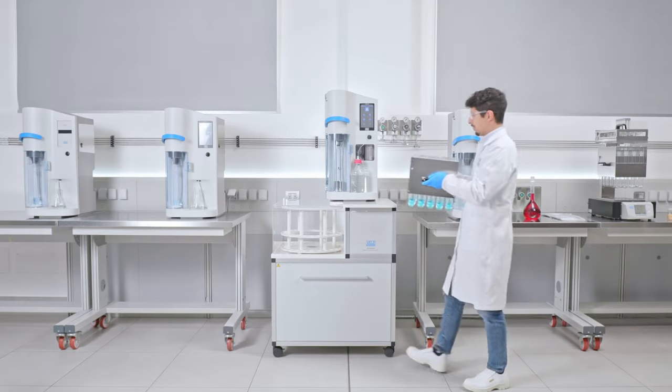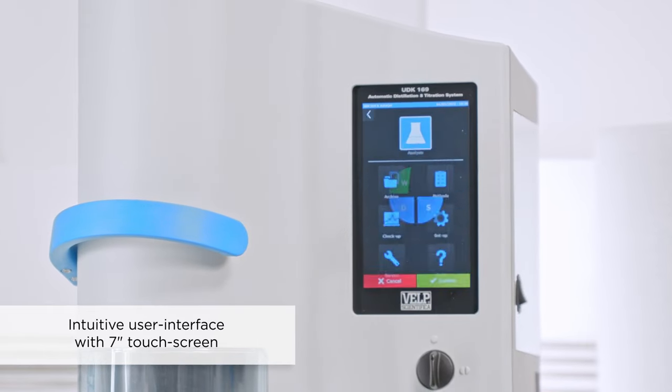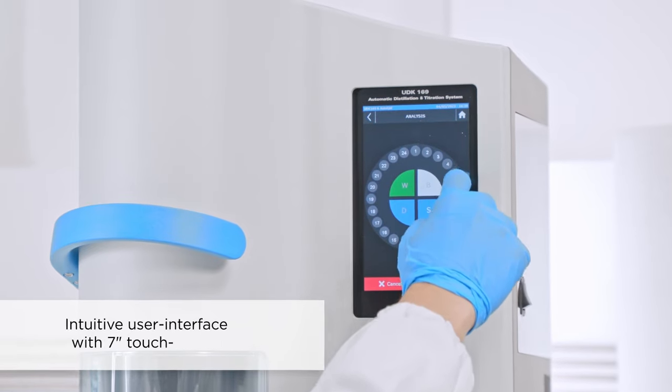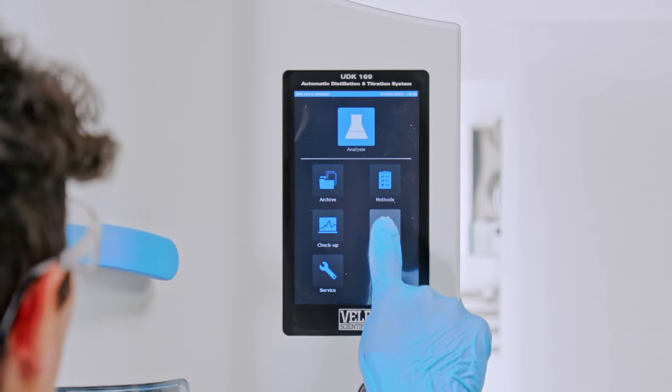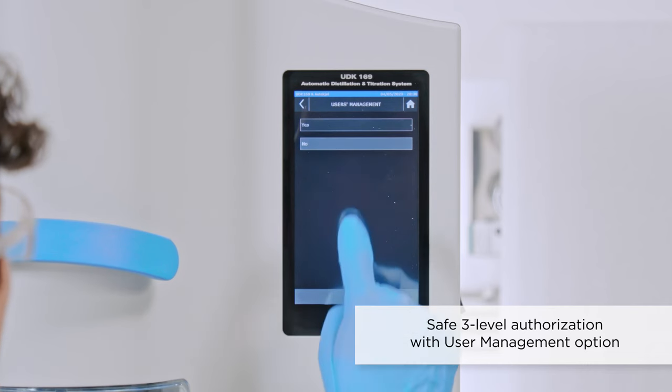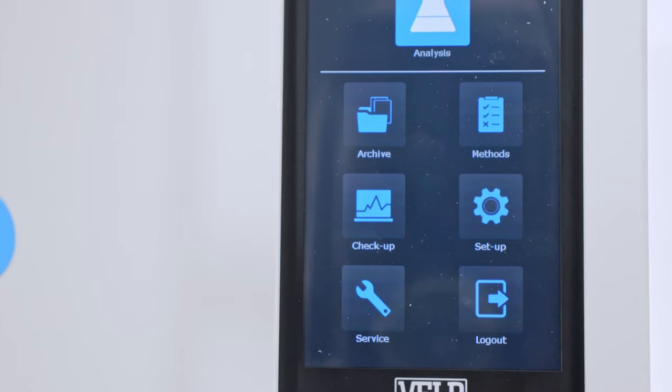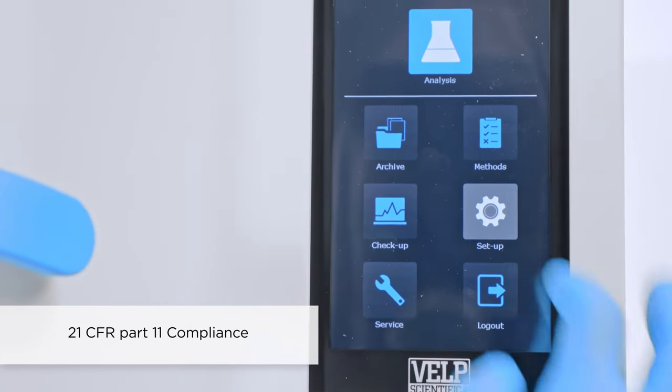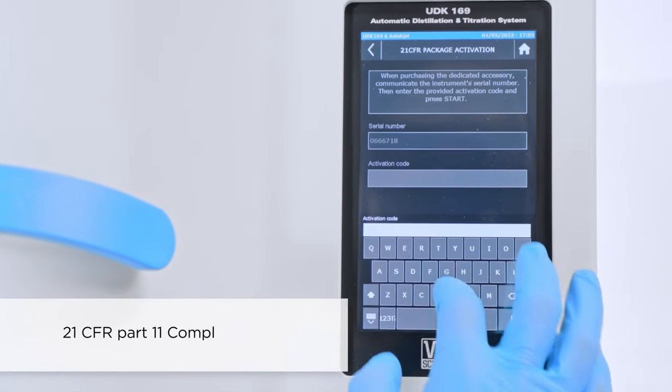Working with UDK169 is easy and fast. Thanks to the intuitive user interface and the bright 7-inch touchscreen, the operator can easily control each step of the analysis and access results seamlessly. The user management option ensures security and compliance, granting access with three levels of authorization. Furthermore, the optional 21 CFR Part 11 upgrades the software for FDA compliance.